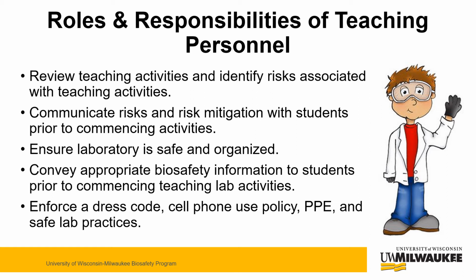If you're teaching in a teaching laboratory that involves the work with biohazardous materials, it is your responsibility to convey the appropriate biosafety information to students prior to commencing the teaching lab activity. Enforce a dress code, a cell phone use policy, PPE, and safe lab practices guidelines in your classroom.